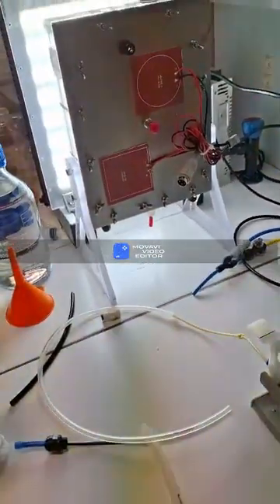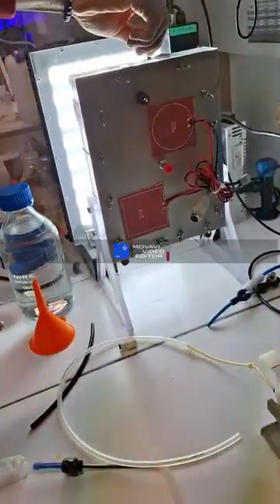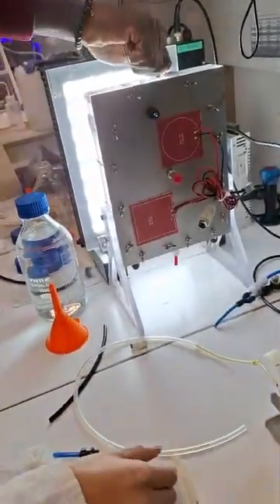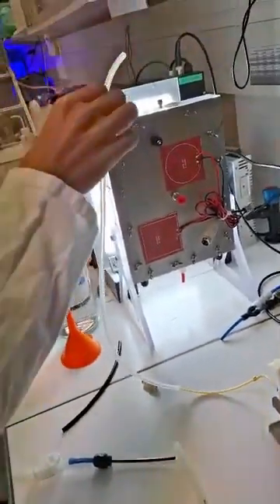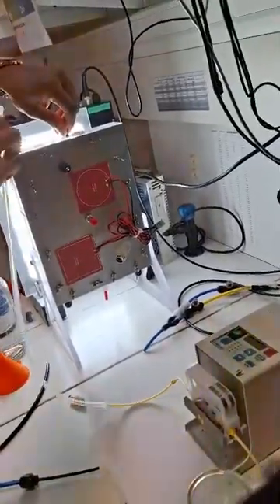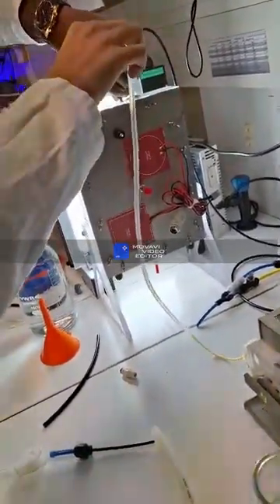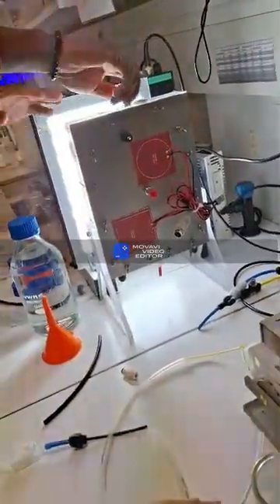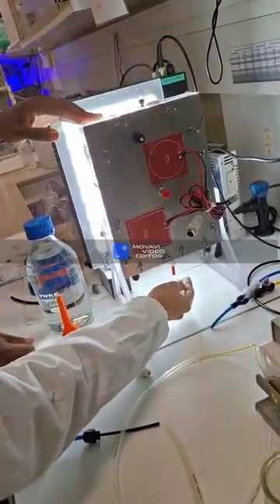One maybe for outlet, but I found three. That's why I'm confused. Which is inlet, which is outlet? So this one, for removing the culture, and one for inlet. Yes, you can use this one for inlet, because we supply media from here. That's why this is inlet, and red will be outlet. This one at last will be for harvesting section.